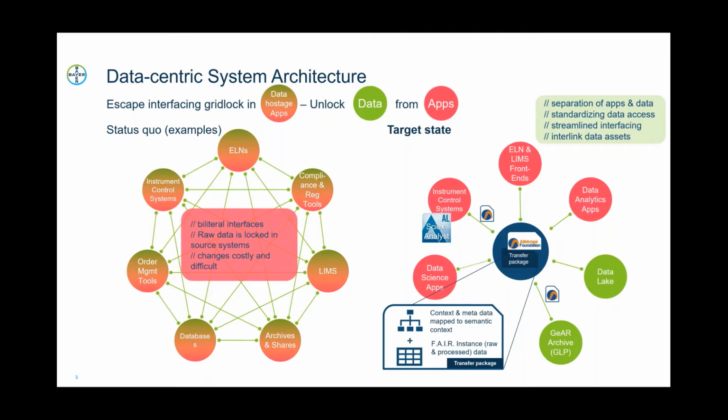To review briefly from our previous presentations, we implemented a converter in two pieces. On the Analyst software side, we extract data, place it in a data model that is hierarchical and exposes all of the information for a run.